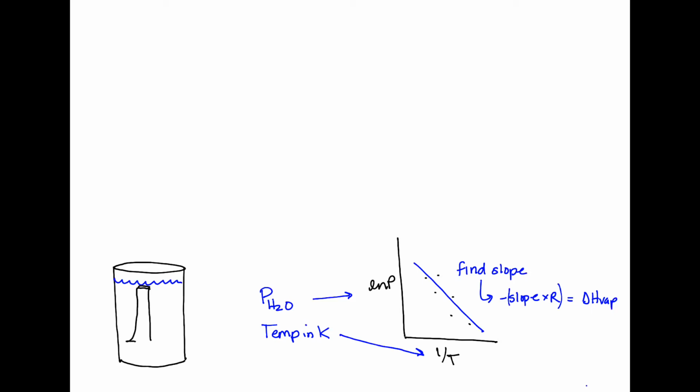and the graduated cylinder is going to have some air trapped in it, and it's going to have some water in it. So all this here is all water. And there's a little bit of gas, air gas, trapped in our graduated cylinder. And the gas that we trap in this graduated cylinder is actually some air plus some water vapor.